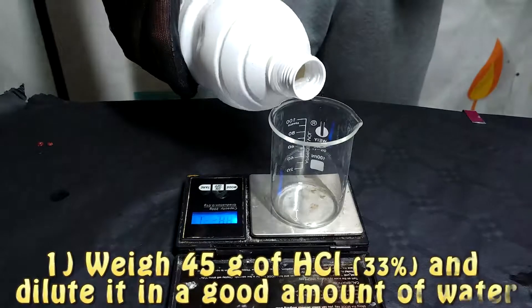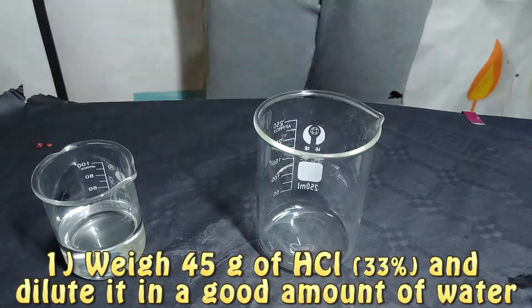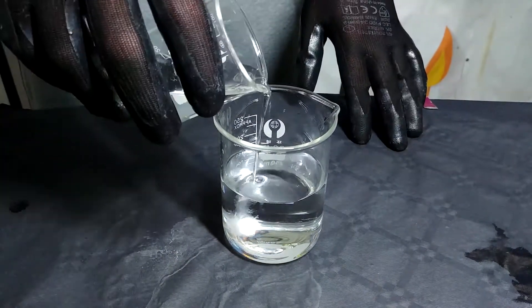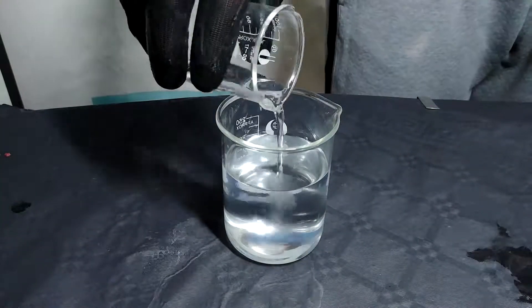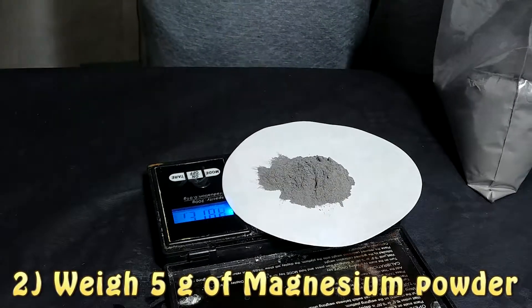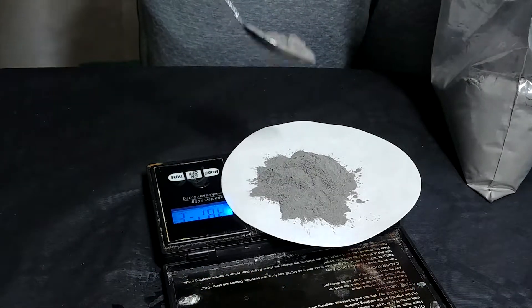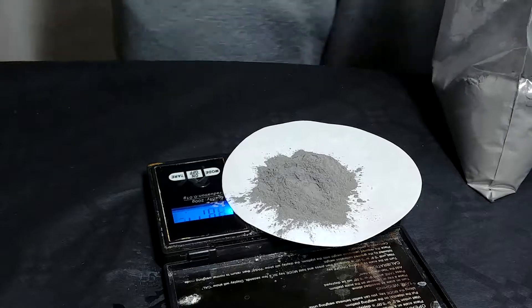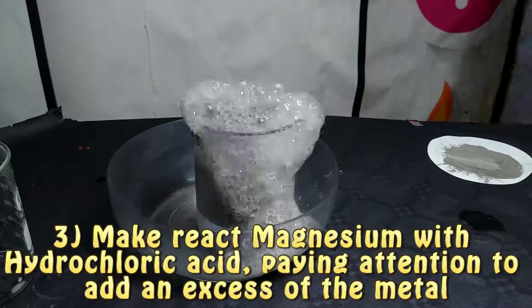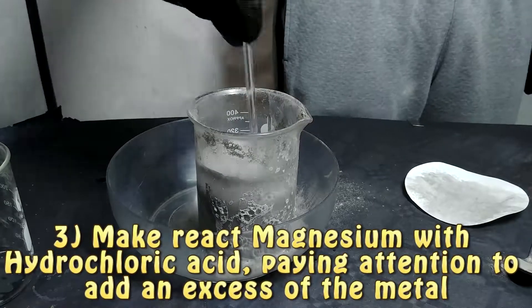The first thing we are going to do is obtain some magnesium ions, which are not really found freely in nature. So we are going to take magnesium powder and make it react with some hydrochloric acid. Then we are going to filter the solution to remove any remaining magnesium, in case there is an excess. We will then repeat the same procedure — placing aluminium foil on top of a beaker, pouring our solution on top of it, adding a bit of sodium chloride solution, and waiting to see what happens.